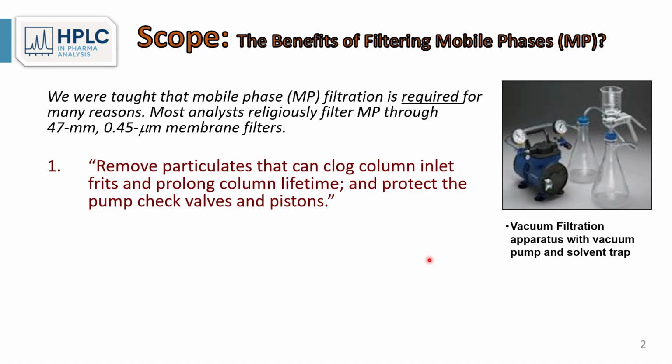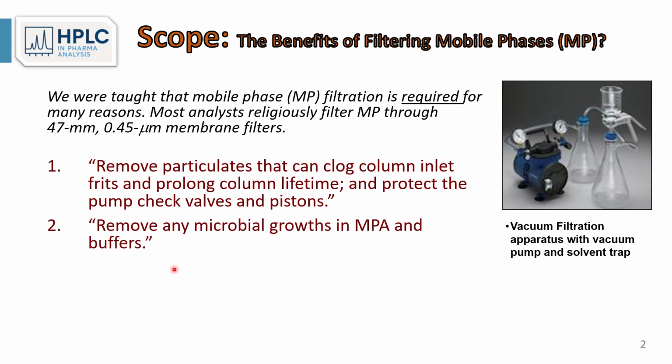The conventional wisdom told us that removing particulates can help eliminate clogging of the column inlet frits and prolong column lifetime and protect the pump check valve and pistons. Second, it can also remove microbial growth in mobile phase A, and particularly in buffers.